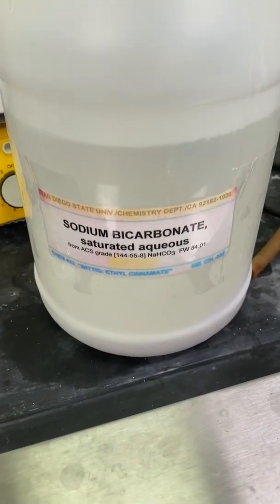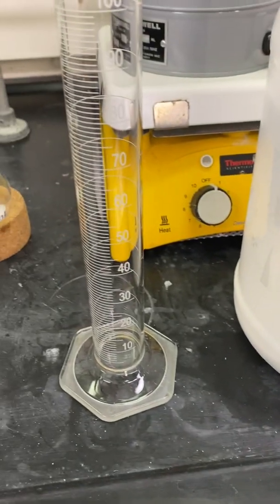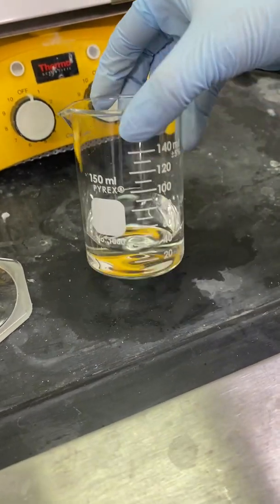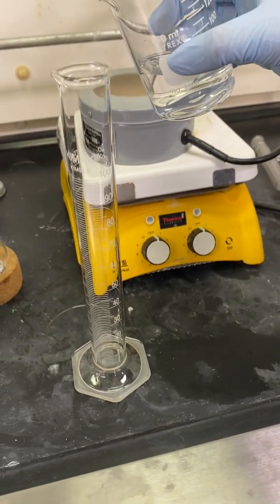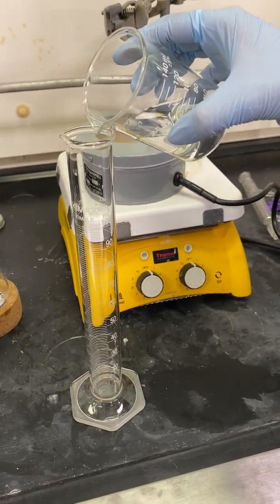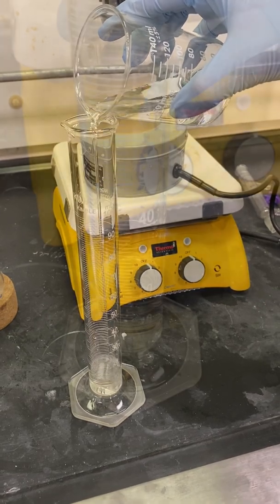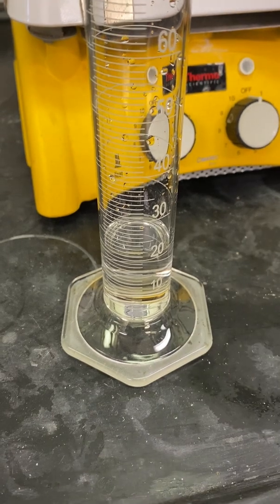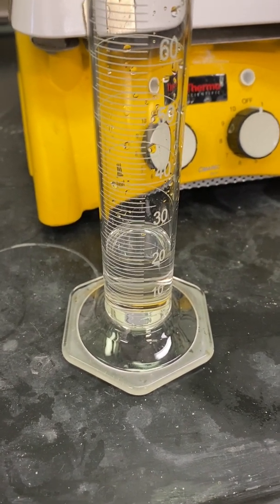After I've added in my triphenyl phosphine, I will now measure out about 20 mls of sodium bicarbonate to add to my reaction. I have poured some of the sodium bicarbonate solution into a 100 milliliter beaker, then measured about 20 mls into a 100 milliliter graduated cylinder. I will now proceed to add it into my round bottom flask.